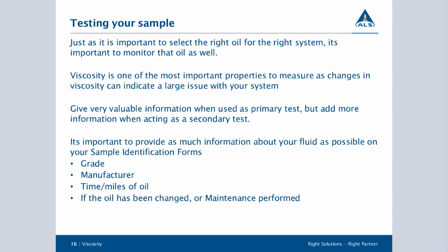So we try to help you out as much as possible and really get as much out of that testing as possible, because you're submitting your sample in. And the more information you provide and the more correct the information is, the better. I've had customers that have nothing on their SIFs and they fill it out, and we work the best that we can with them. And then I have customers that fill out their SIF and attach printed versions of their product data sheet. You don't have to go that extreme, but the more information you provide on the system, the more valuable your results will be to you and to us.